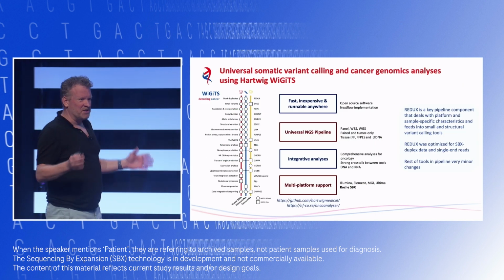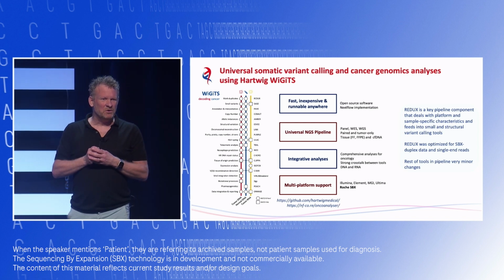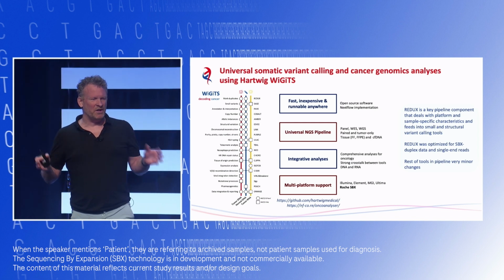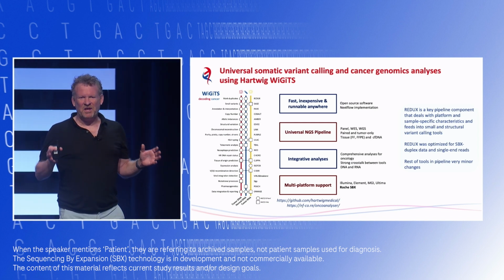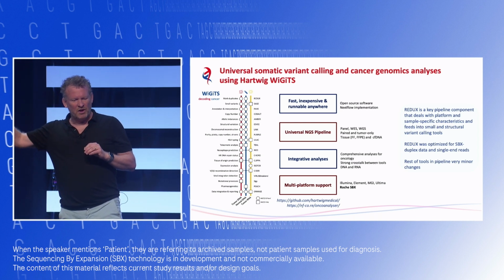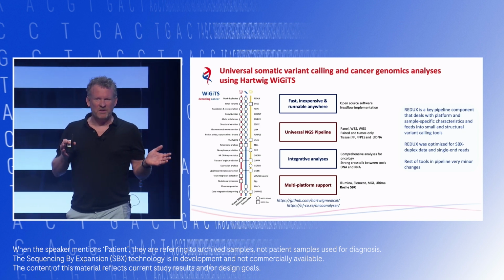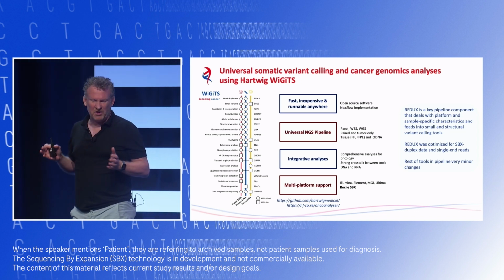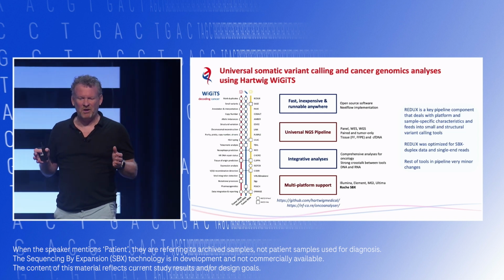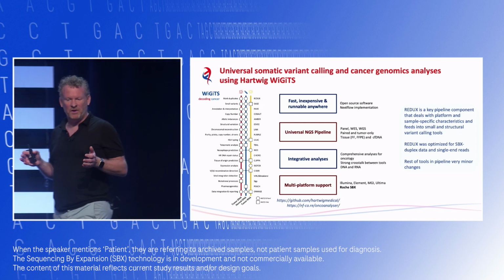Okay, that's coverage, that's the basics, that's where you start. The next step is variant calling. We did this with our package of tools. This is a package that we use in routine diagnostics, and it's not just variant calling; there's also HLA typing, viral detection, all these types of things that can be relevant for the clinic and for a cancer patient. You see the features here. You can use all different types of data as input, from FFPE, from panel, etc. But one of the things in how we designed this software is also to make it platform agnostic, so it should run with every platform. And the key tool in this is Redux, a pipeline component that deals with platform and sample specific characteristics. That feeds into the small and structural variant calling tools.